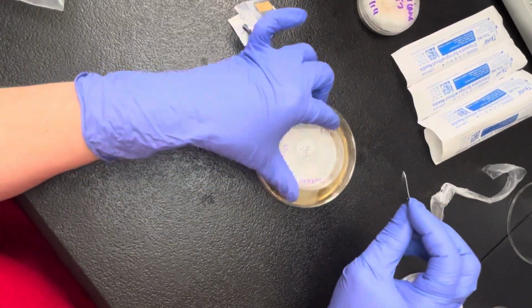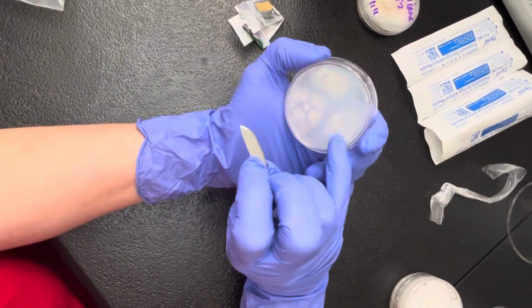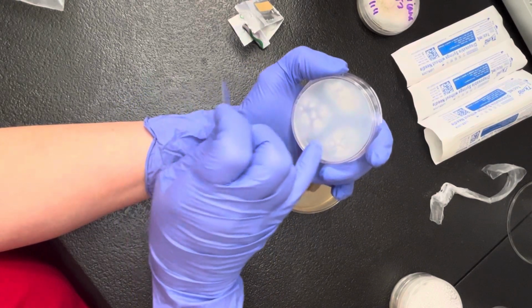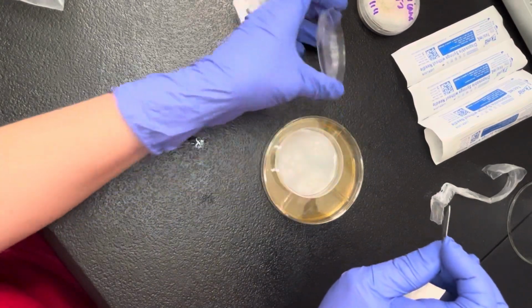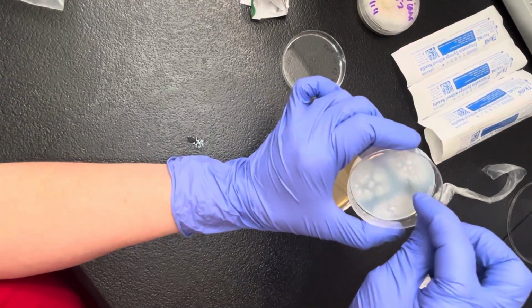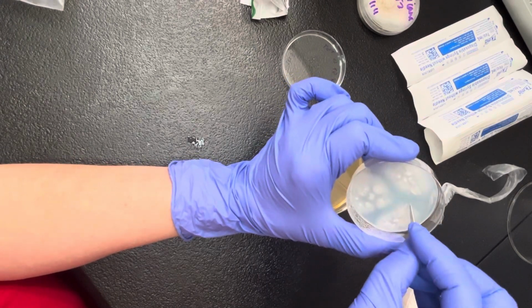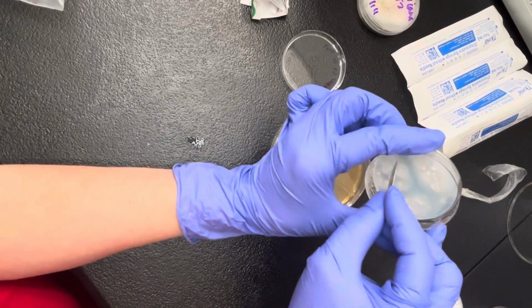I'm going to open this. Before I open it, I'm going to look at where I want to do my transfer. And I am seeing a couple good places, particularly right up here. Over here looks great. I think I'm going to zero in on these 3 spots for now. Holding my plate at an angle, trying not to talk over it.